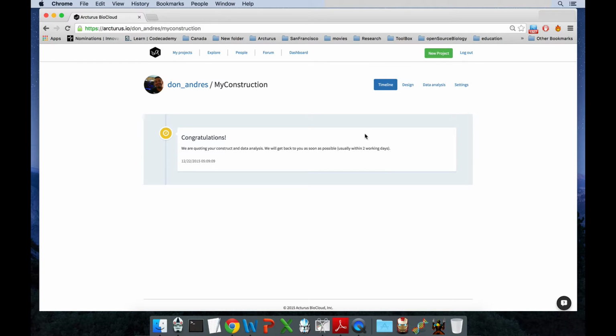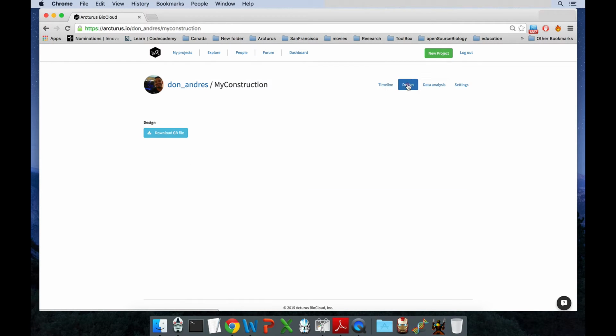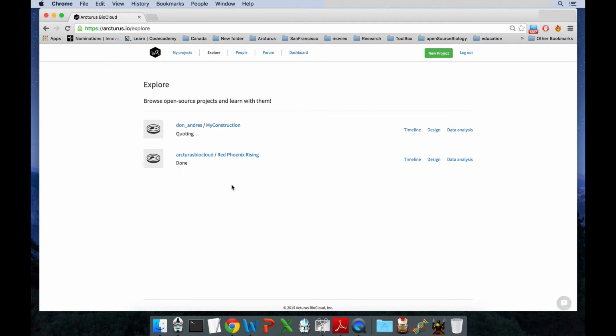submitted. So you can check, for example, the design in which you can download the GB file that you uploaded. You can also see which experiment you selected, and you can also select if you want it to be a public project or a private project. Let's see, for example, in the platform other projects that have been submitted. So now here is your project, but also we have some featured projects.